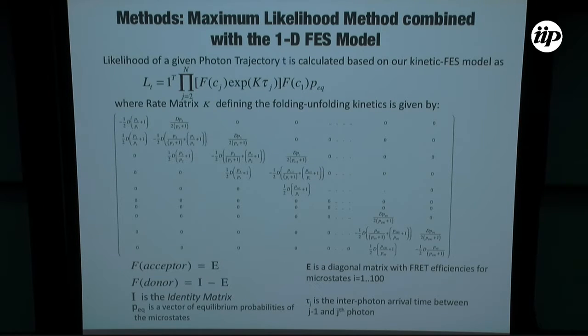So you can still see the molecule is going to move even with one minimum. It's fluctuating. And from there you can get the diffusion coefficient well because you are not jumping over barriers and you still see dynamics going on. But that means that you have to have a system in which your time resolution is better than the dynamics of the protein. And this is why it's important to do experiments at low temperature, because that way we can get close to that.